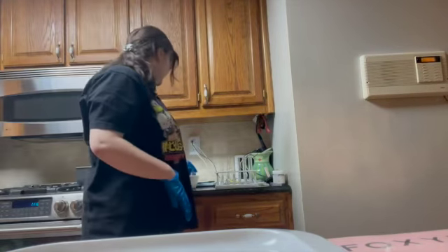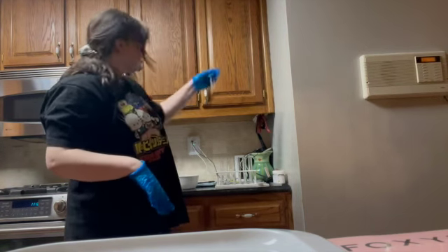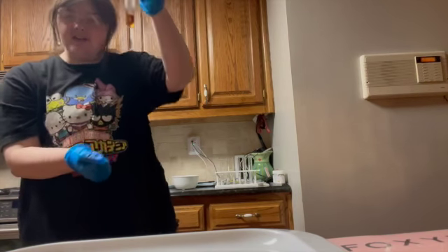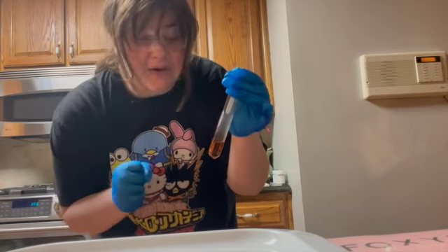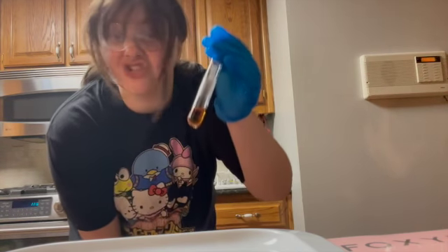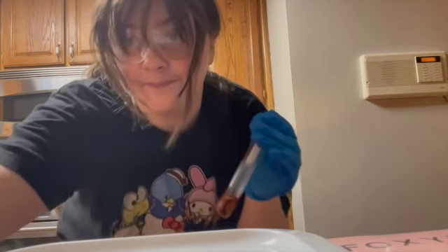Okay, it has been a long time since I've last checked in, but it's at an hour 20-minute mark, and it's showing a lot of significant changes. It was this amber color, but now you can clearly tell that it's this orangish color. It's getting lighter as we speak. And so we'll maybe take about 15-20 minutes and see if this changes to a significantly lighter color, or maybe get clear by that point.